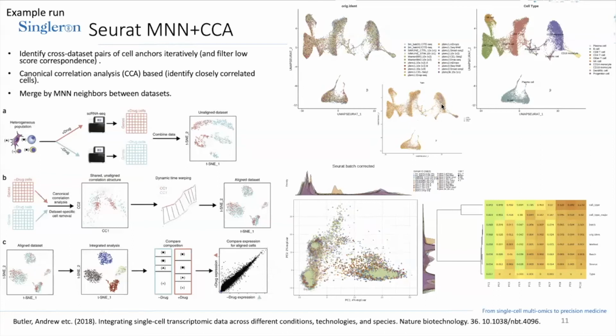So later we will look at the clustering result to see whether we will be able to find any disease-specific clusters from Seurat. But from the UMAP itself, we begin to have some doubt here. Is it maybe overcorrecting a little bit, because the disease-related cells are hidden underneath the normal cells?